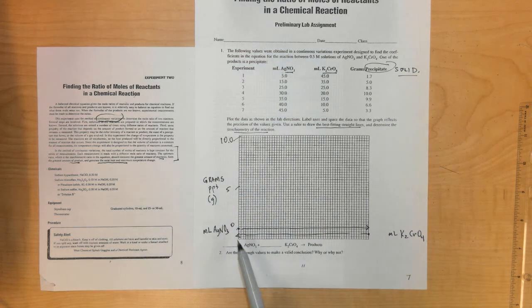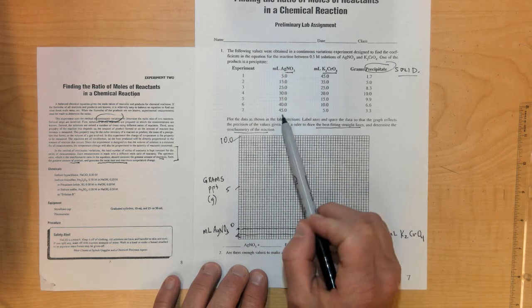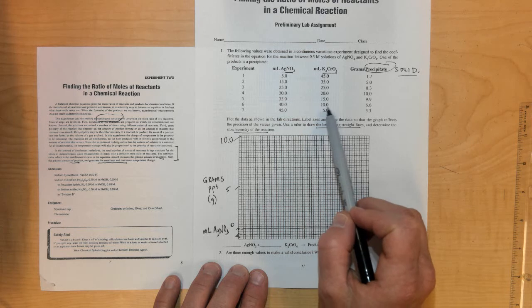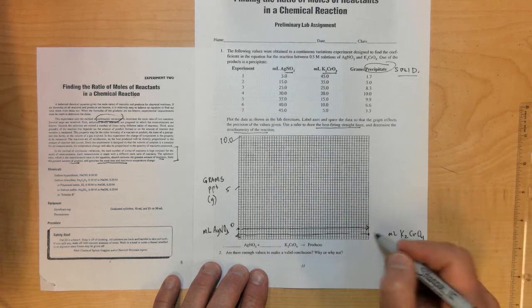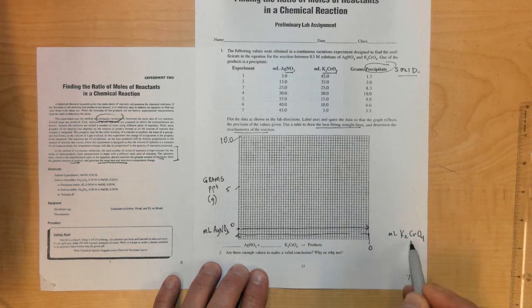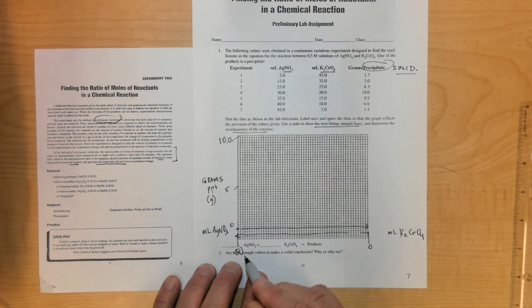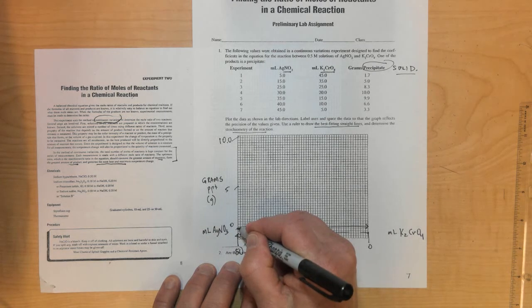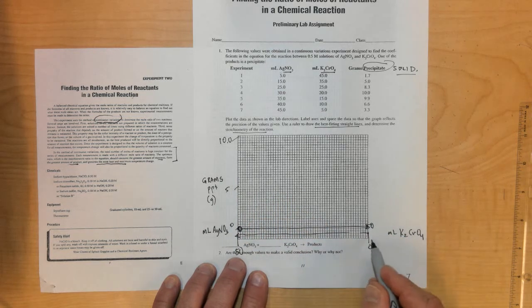And then my volume, you'll notice, starts at 5 and goes to 45, and then when it adds to the K2CrO4, it's always going to add up to 50, so 45 plus 5 is 50. And so I'll start with 0 milliliters right here of K2CrO4, and I'll go all the way to 50 over here on this side, and I'll go the opposite on the silver nitrate, where I will start with 0 amount of the silver nitrate here, and I will go to 50 at this point.